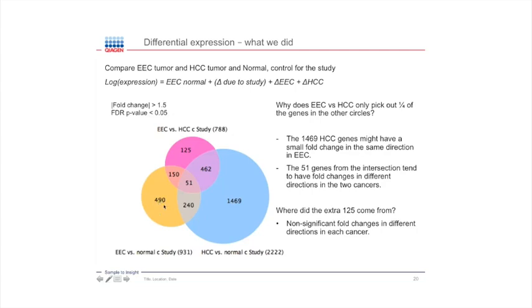So they're also just generic cancer pathway genes, and they just by an accident of fate don't quite make it into this shared region here. So it's very powerful that you can control for this effect. You can directly compare the two cancers without having to worry about how your cutoffs are affecting the genes in the two lists that you're looking at.